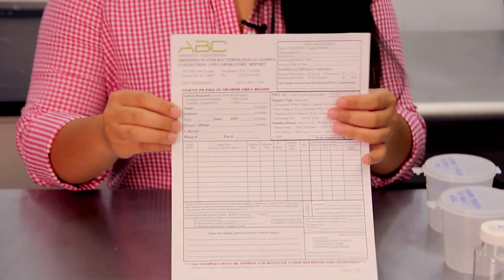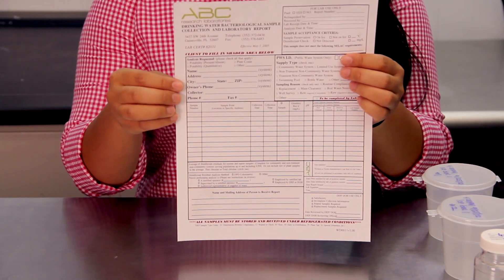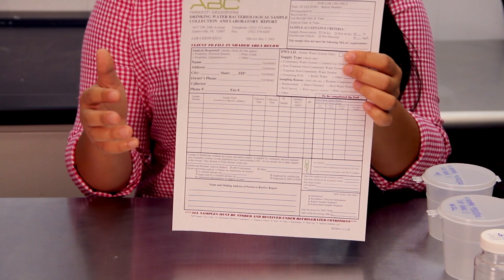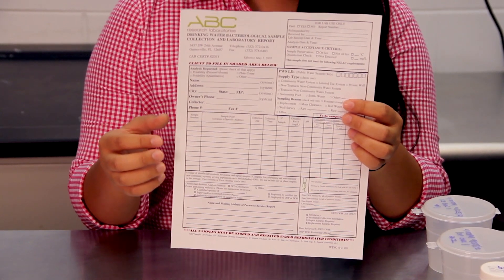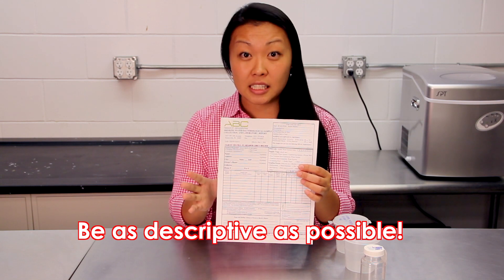Before you start sampling your ice or your water, go ahead and fill out your sample submission form and label your specimen cups. You will notice it's going to ask you for your name, your address, the owner's name, as well as the collector's name. The owner and the collector might not be the same person. You will also notice they're going to ask you for a description of your sample and the time and date that you collected your water or ice. Be as descriptive as possible, because this is where you're going to see your reports.